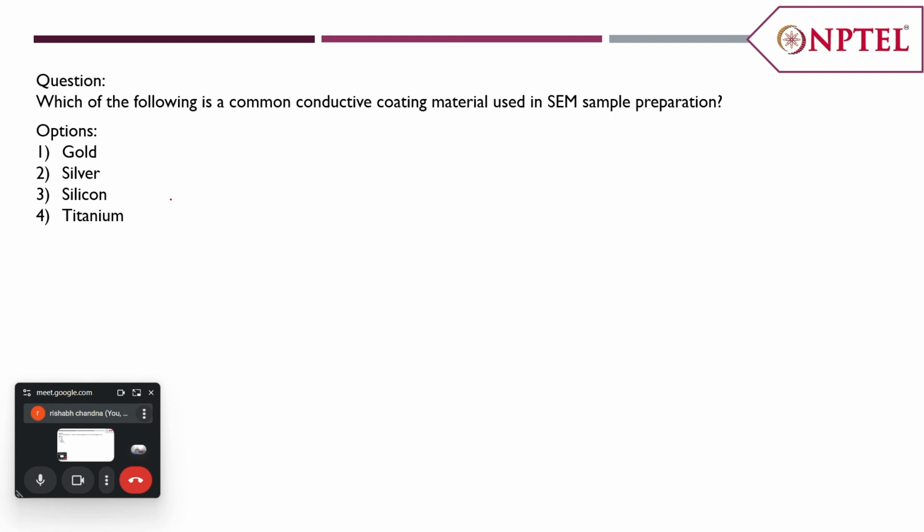Okay. So what will happen? Why do we use the conductive coating material? For example, this is the specimen that needs to be visualized for a particular experiment using SEM. Here we have to visualize using electrons. Electrons are basically emitted in a specific manner, so that using the screens the electrons will be imaged and a shadow of the specimen is constructed.